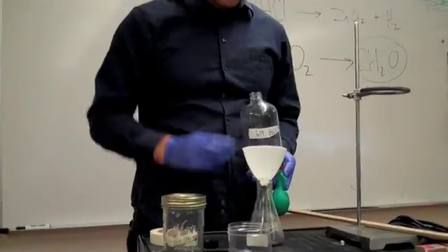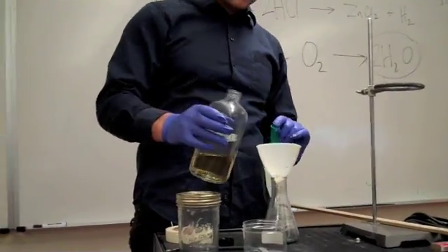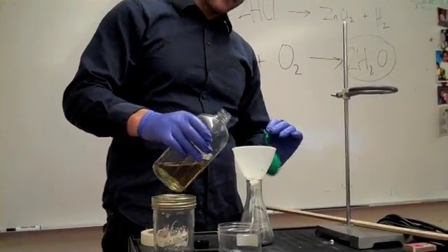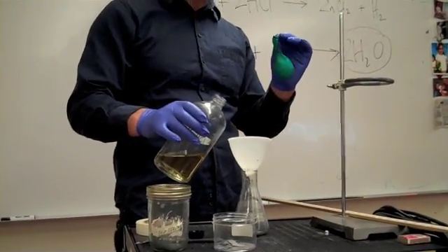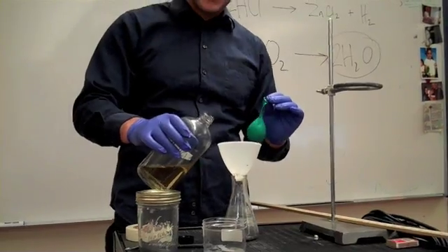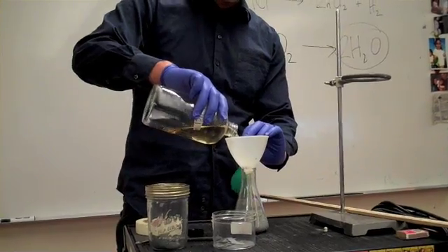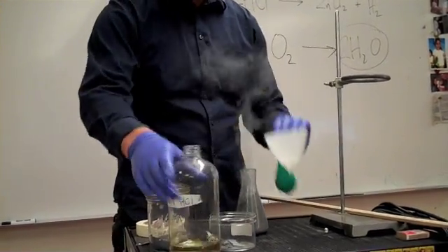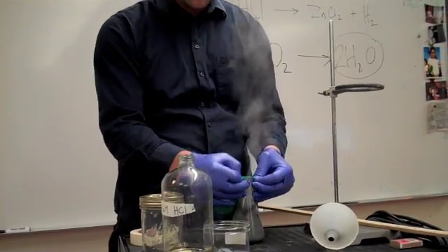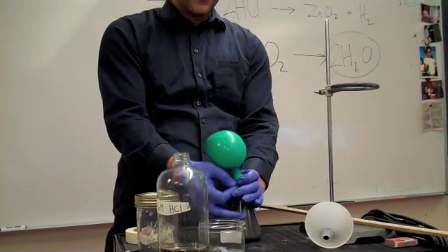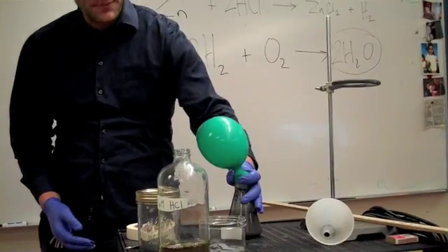I'm going to pour some hydrochloric acid in here. It's going to let off a little bit of vapor, and I'm going to quickly try to get this balloon on there to capture the hydrogen gas. And there we go - hydrogen gas is being produced.